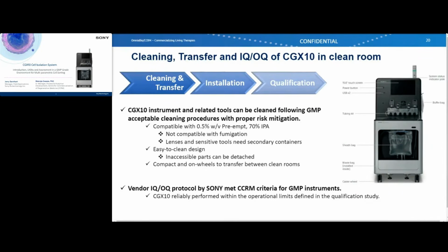In this task, CCRM performed qualification studies to verify that the CGX10 is installed and operated within established limits and tolerances in accordance with the manufacturer's specifications. Based on these assessments, the CGX10 system has been deemed suitable to install and operate in a GMP facility.